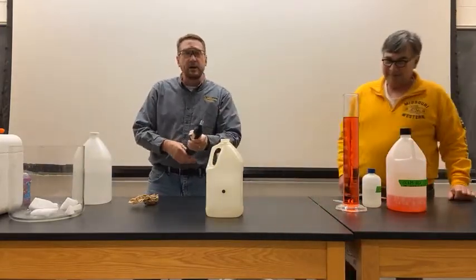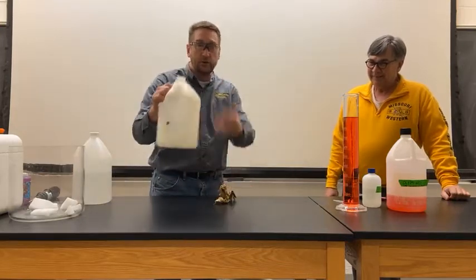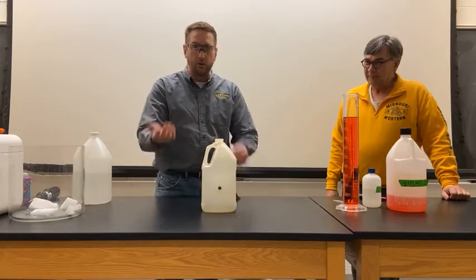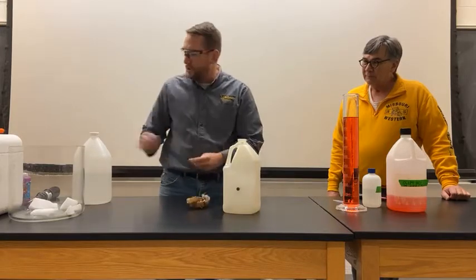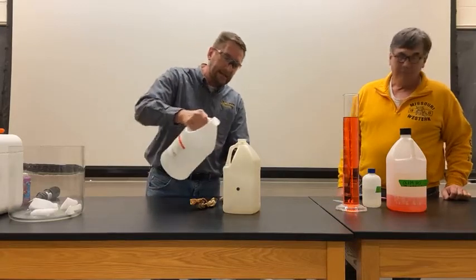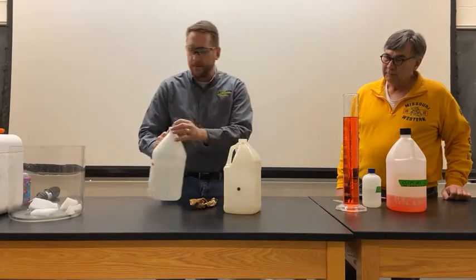All right. So now one of the things that I want to show you, I told you earlier that if we burn that ethanol, we get water and carbon dioxide. And we also said earlier that carbon dioxide doesn't support combustion. So one of the things I want to do here is put a little bit of ethanol back into this, and we're going to try and do it again.